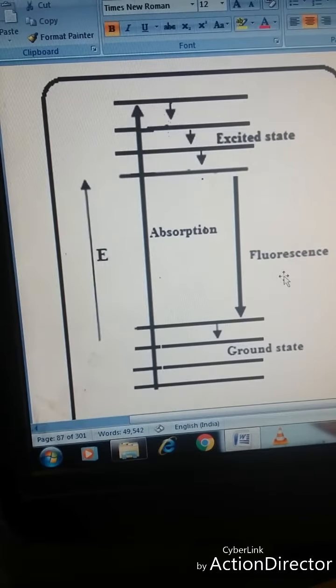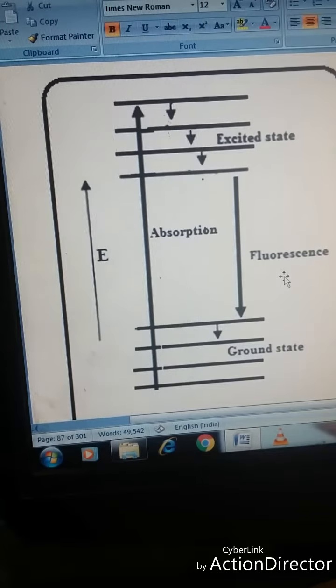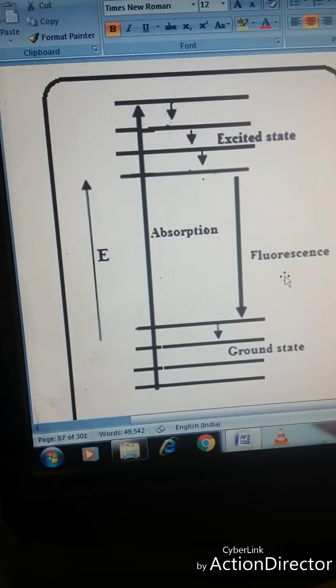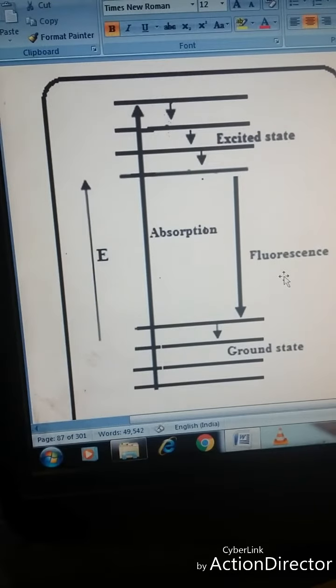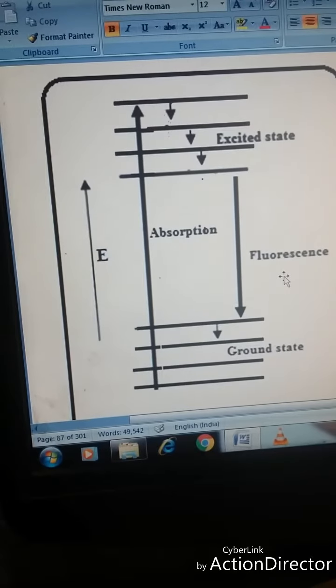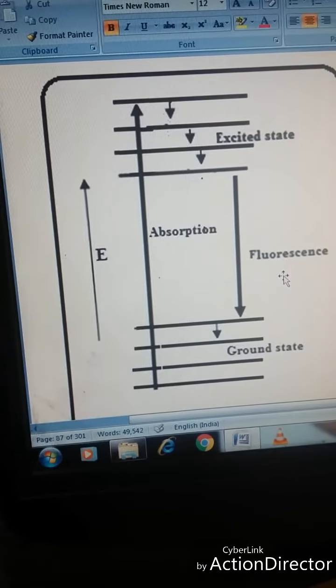Fluorescence has found great importance in the medical field, especially in the detection of tumors. Fluorescence spectroscopy is also used for in vivo detection of skin pathologies. As the skin contains elastin, collagen, keratin and NADH, which are chromophores, they contribute to the fluorescence spectrum. Skin cancers can be easily diagnosed by using the fluorescence technique.